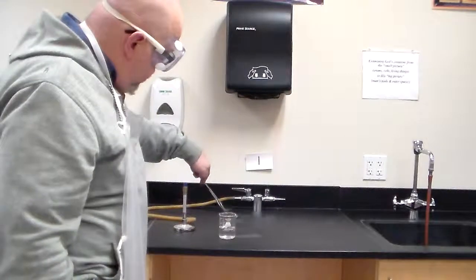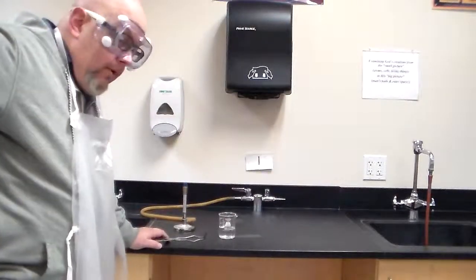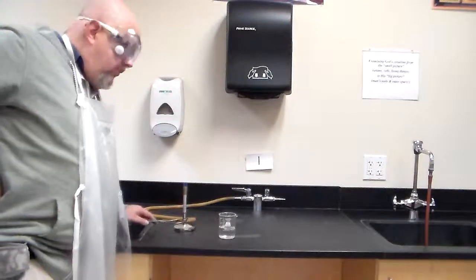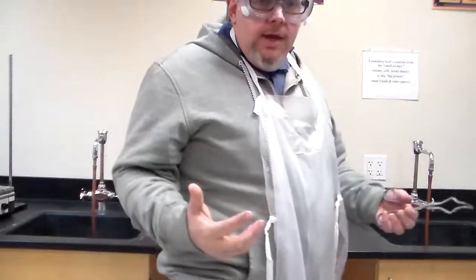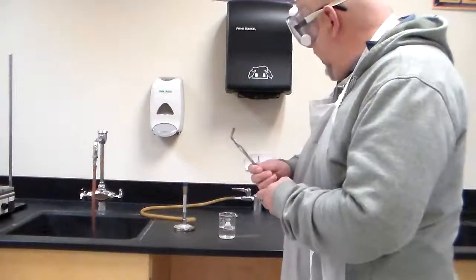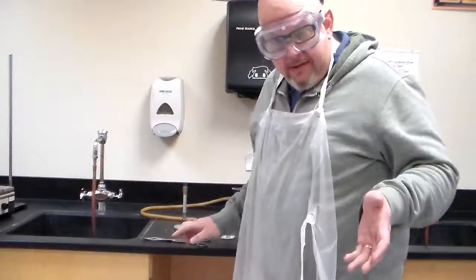So we need to put that in the glass beaker full of water to extinguish the fire. Now you do not need to extinguish the burner because you guys are continuing to work with your tests, okay? So there'll be a few tests that you will perform today and hopefully, you can answer some of the questions on that.